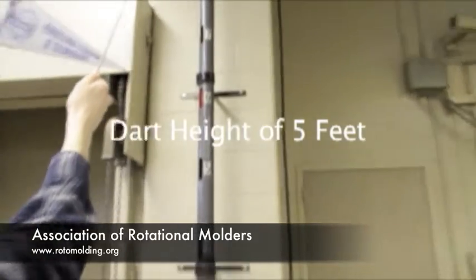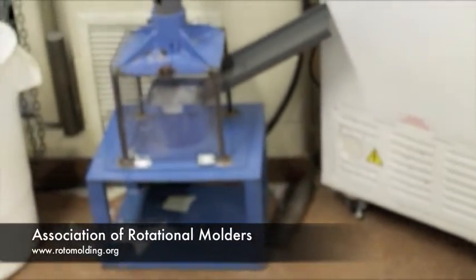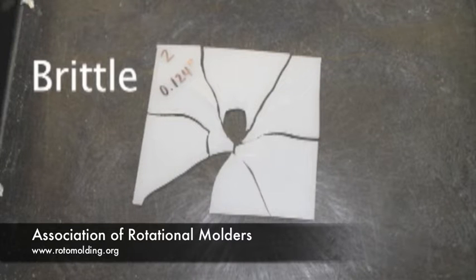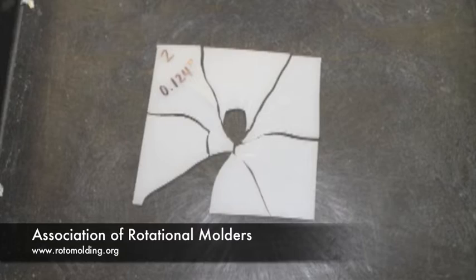Two types of failures include ductile failure and brittle failure. Ductile failure occurs when the dart elongates the sample and punctures a hole in the test specimen. Brittle failure occurs when the test specimen shatters or splits into two or more pieces.